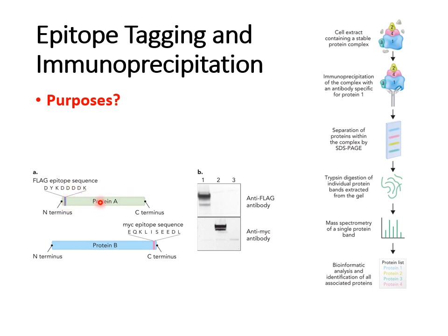So even though, let's say, protein A that you're studying is not very well known and there are no antibodies you can buy for it, all you do is put that little FLAG tag or MYC tag on your protein, and now you just buy the already made anti-FLAG antibody. You can use immunoprecipitation to pull down your protein from a mixed sample, or you can use the antibody to visualize your protein on, let's say, a Western blot.